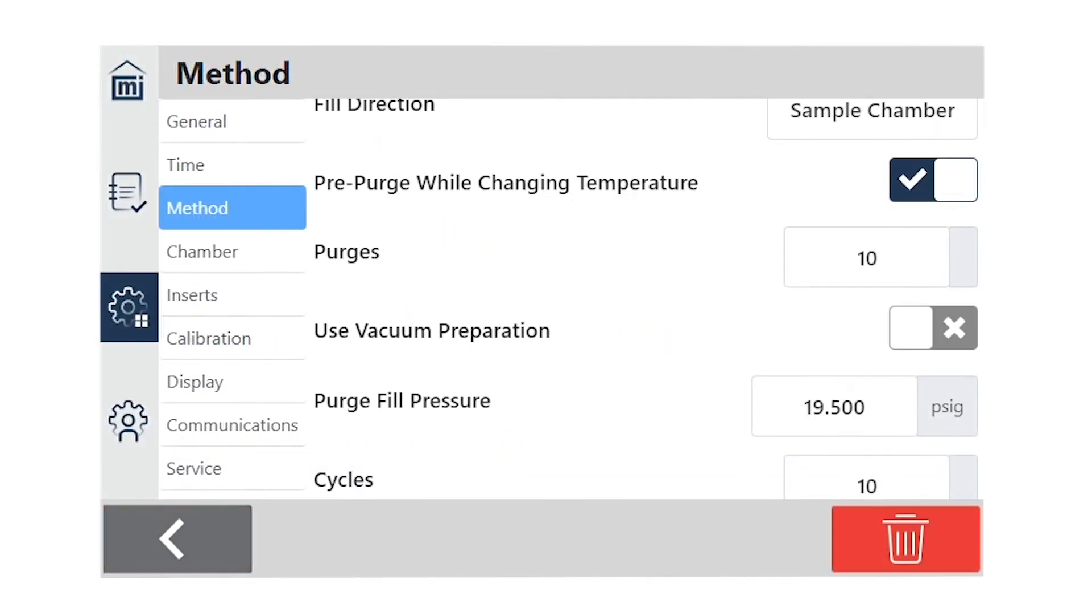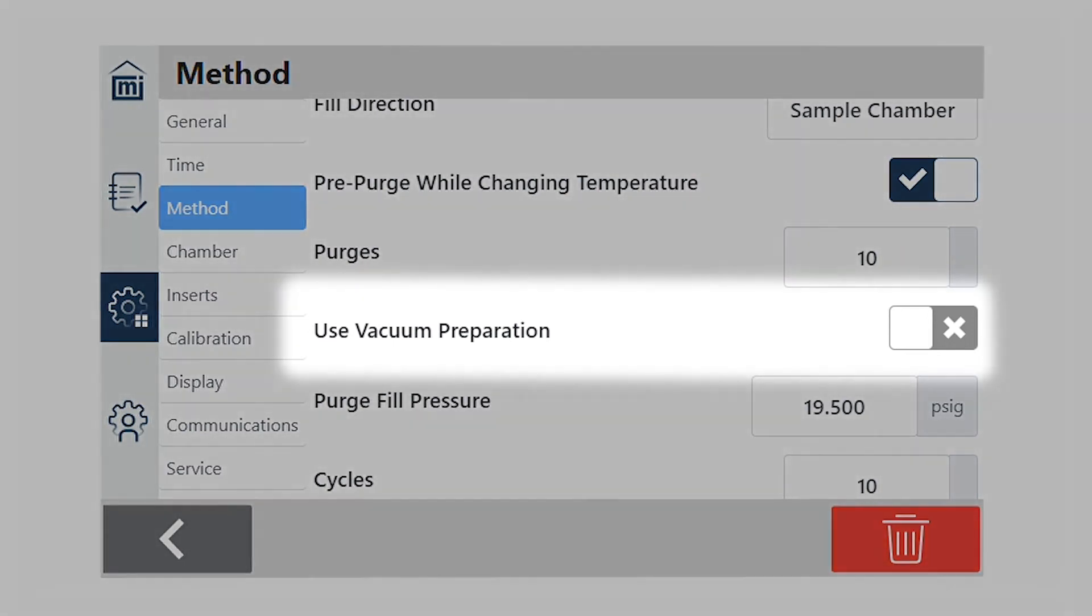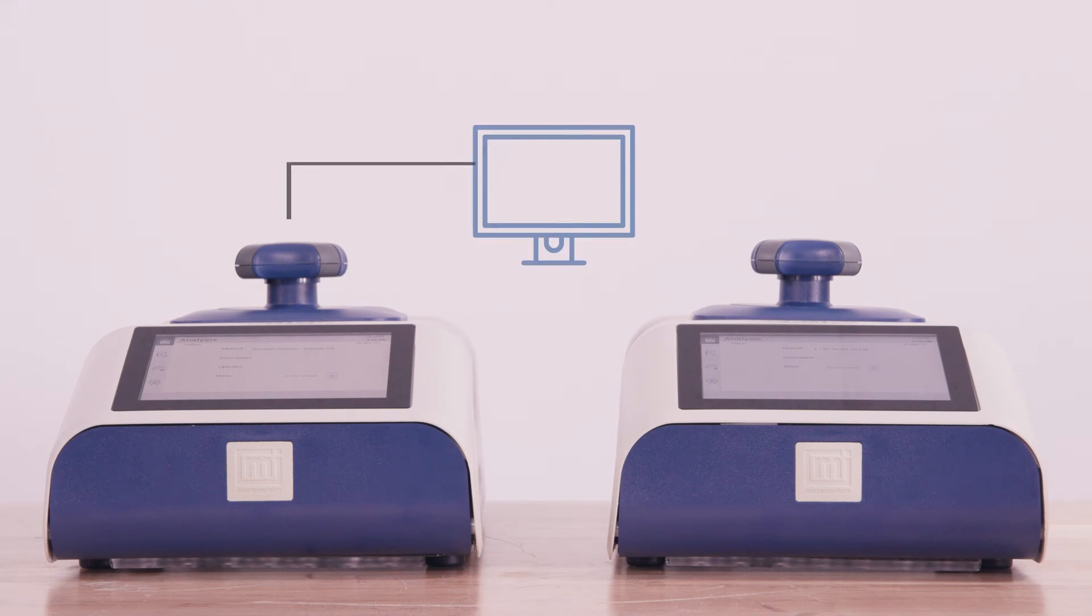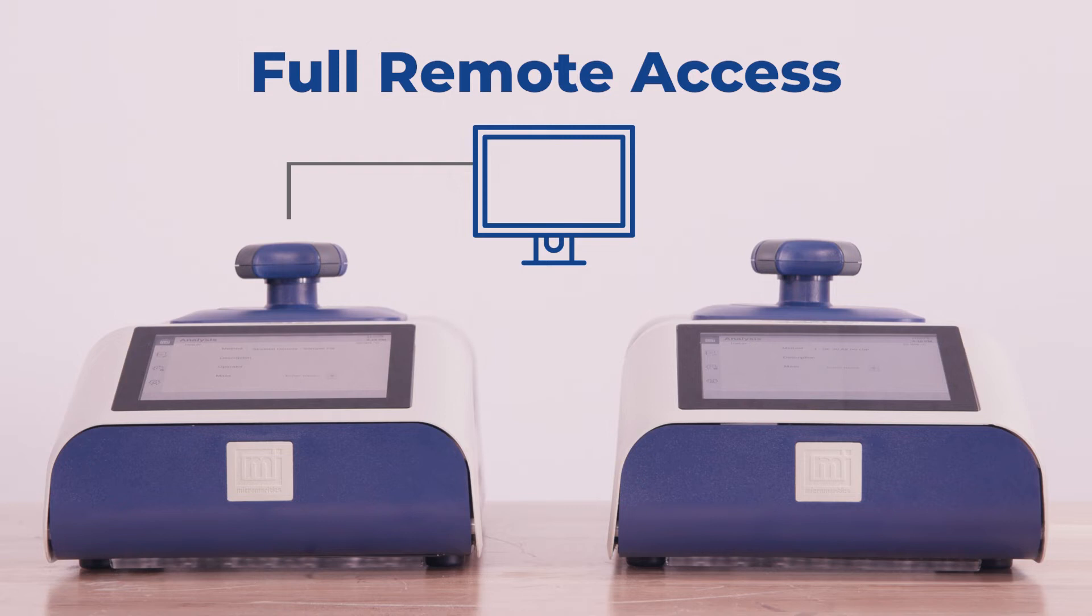The AccuPIC offers both vacuum and purge preparation options to ensure the most accurate data. While this analysis is running, let's talk about some special features of the new AccuPIC. You can connect the AccuPIC to your network and have full remote access from any computer on the same network.